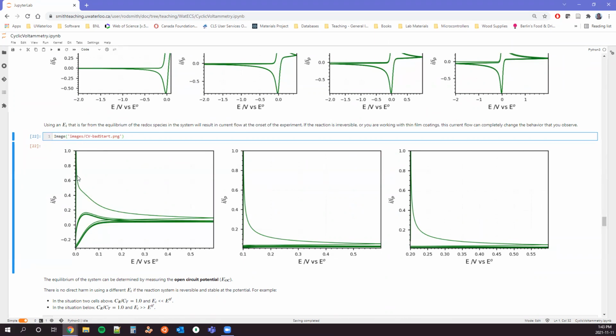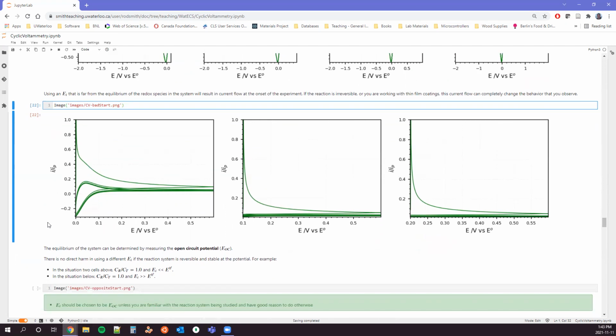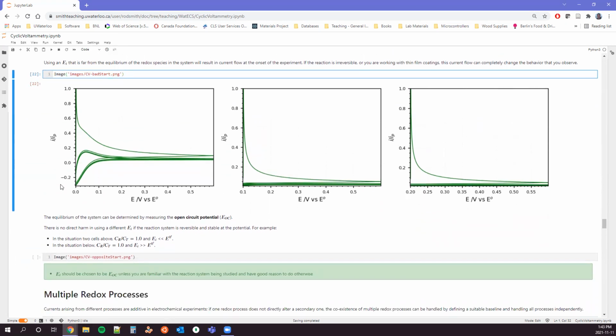Here we see a little bit of thermodynamics kicking in. There's a little bit of a blip. But by the time we go to 100 millivolts positive, all that we see is diffusion limited currents right off the offset. And so we see no peaks. We see nothing happen here because of that, right? You want to familiarize yourself a little bit with what's going on in your system to select an effective place to start. This is easily done with open circuit potential.